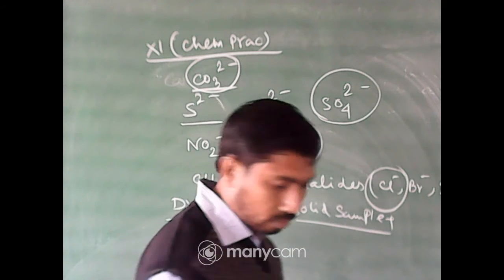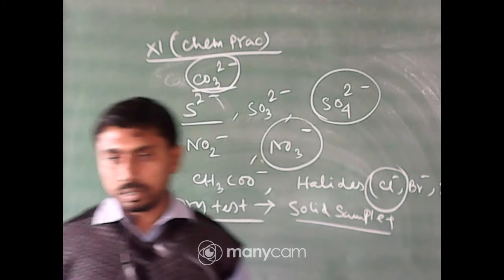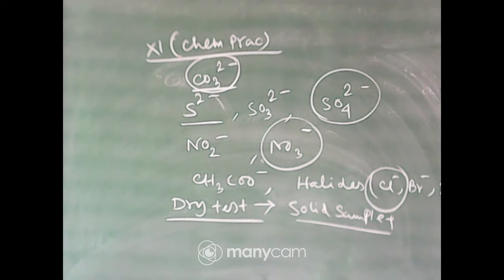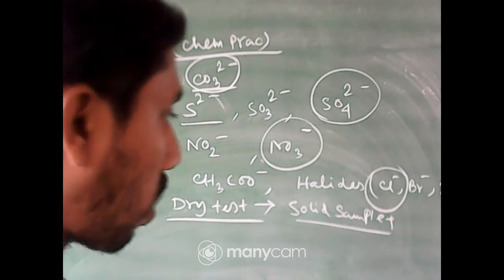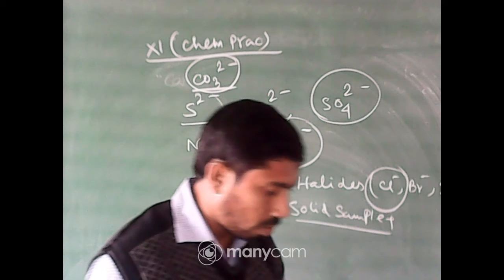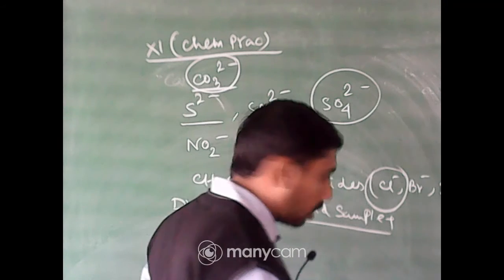Okay. Now, just give me one minute. Okay, so the first test is for carbonate.